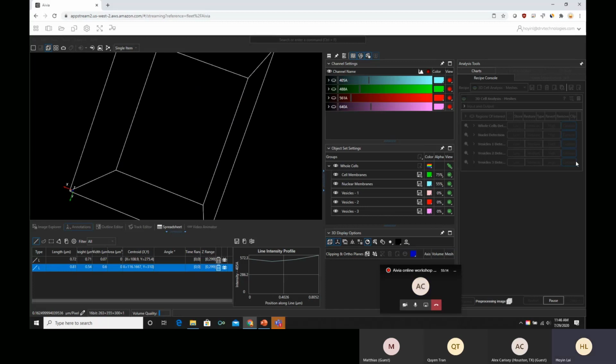So were you guys able to get results with your analysis, or do you guys want to show me what your analysis looks like or anything? Just let me know.